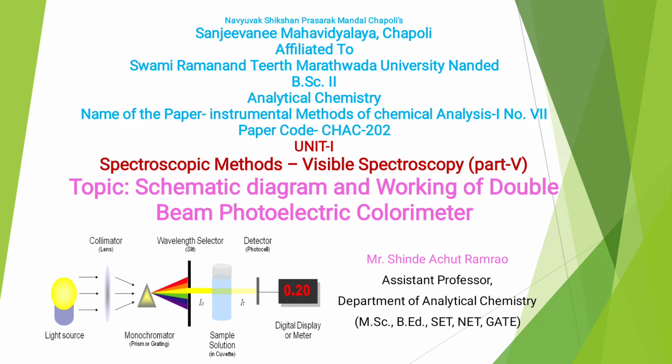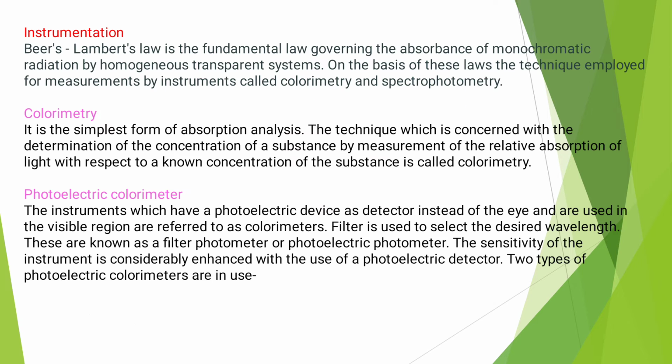it is necessary to see some terminologies, such as what is the single beam spectrophotometer, what is the double beam spectrophotometer, photometer, and terminologies like colorimetry and photoelectric colorimetry.